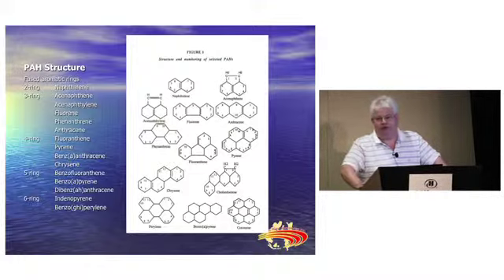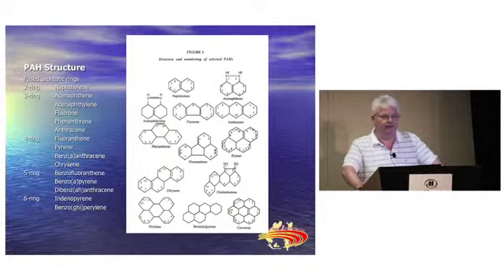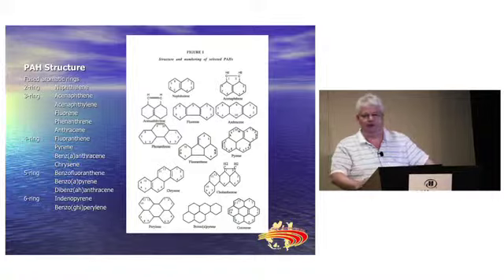About 30 years ago, somebody in the US EPA sat down and said, we've got 16 PAH we want to look at. And those 16 have stuck with us since that day. Whether they're right or wrong, some of them are good, some of them maybe we could care less about, but those 16 are here.